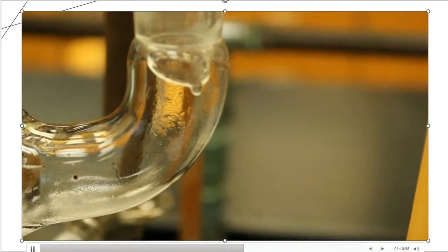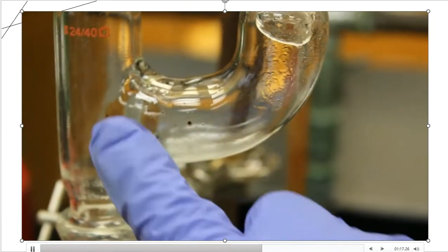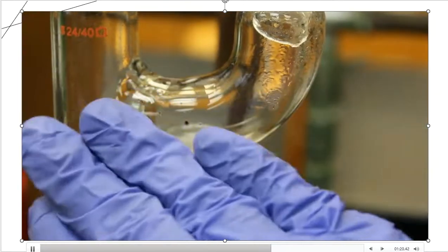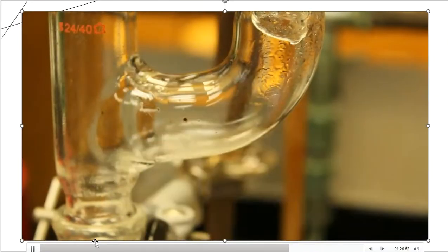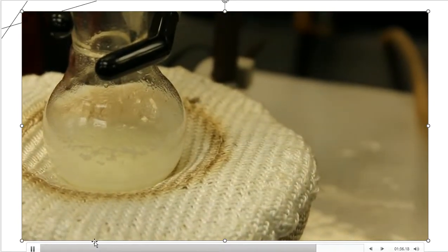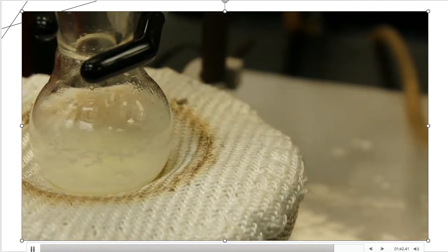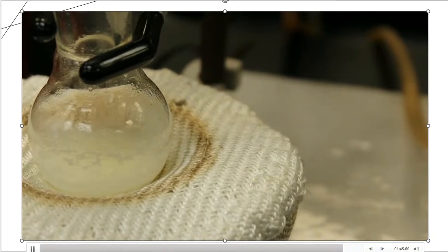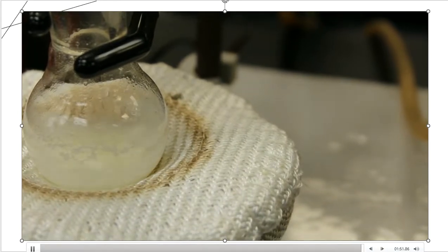And then as I follow it, I see those extra drops getting here in the U-tube. As far as the U-tube goes, I'm going to swerve over. This looks like brownish stain, but that's not. It's just the cabinet that's behind it. So nothing is actually happening here in the U-tube condenser. And then as I continue to go down, I'm beginning to see this white milky solution that's still bubbling, still doing its job, still frothy, but this is a sign that the reaction's going forward like it should. So again, we're looking at another 20 minutes or so, give or take, and I'll pull this away and then we'll go on to the next part of the procedure.